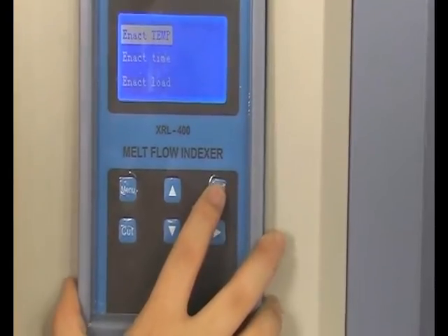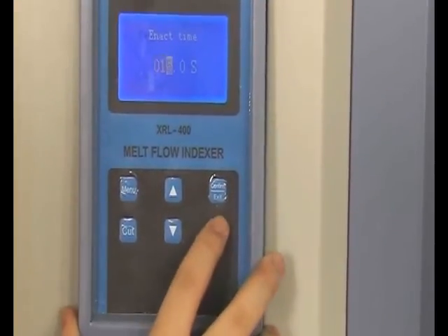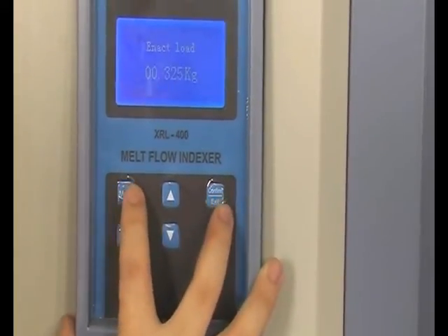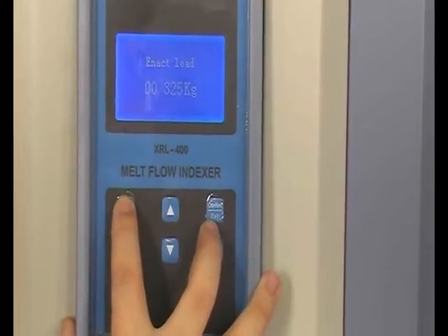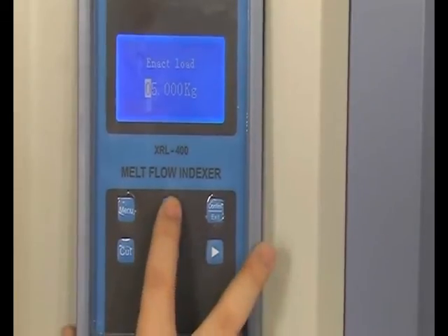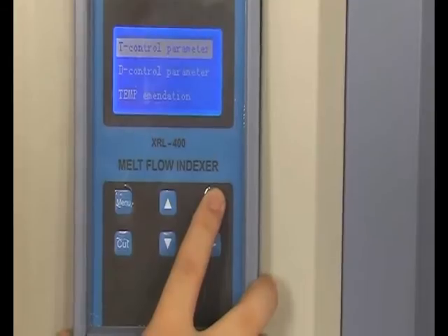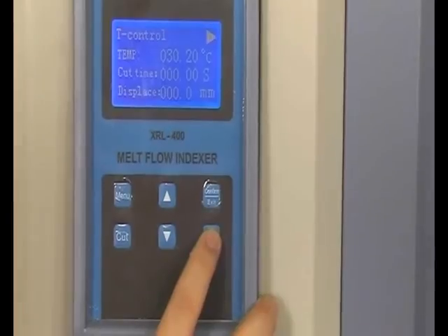Next, let's come to the set interface. Press up and down to set the temperature, time, and load separately. Press menu to enter the temperature setting interface. The time setting is the same as temperature. After setting the temperature, time, and load, press exit to return to the main interface.